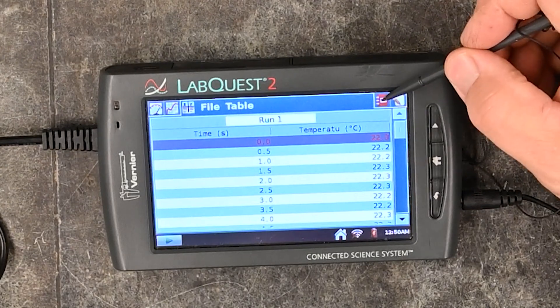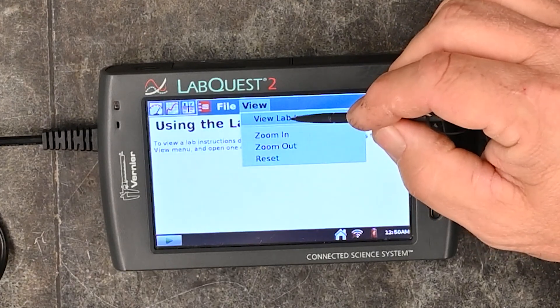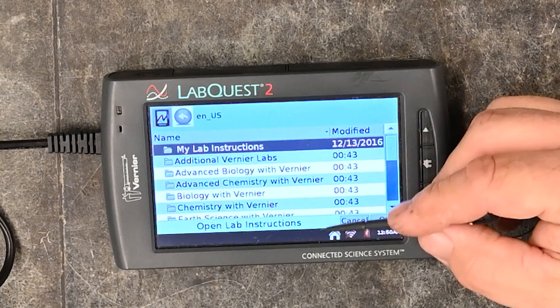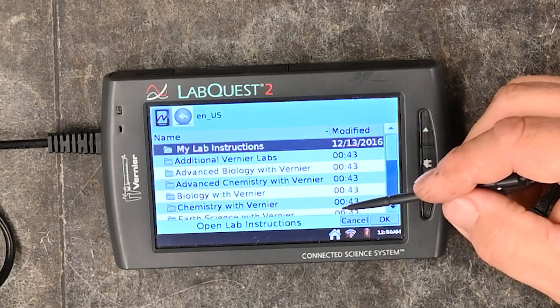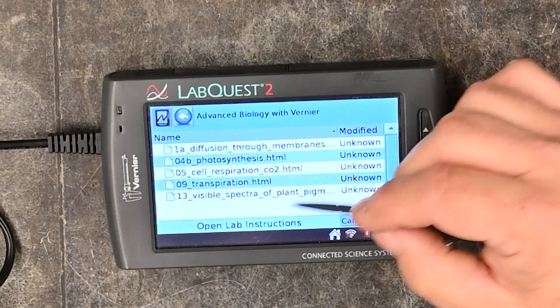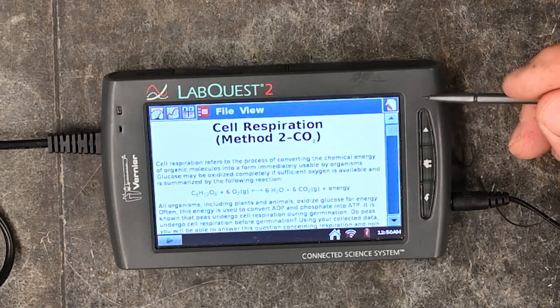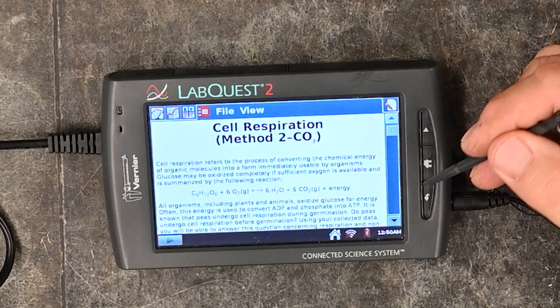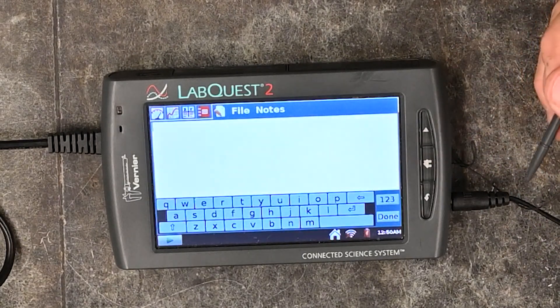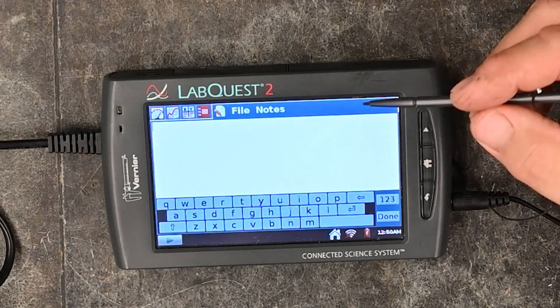The next button is the red lab instructions button where you can view lab instructions. A lot of the labs from the lab books are available here — you can click on them to read the instructions, or you can print them out for your students. The last top button is for taking notes, so students can type notes in there if you'd like.